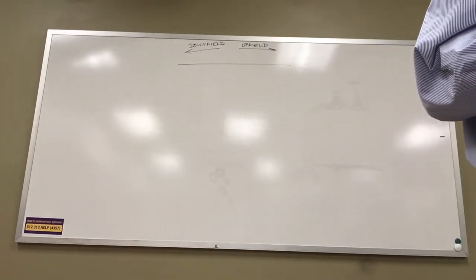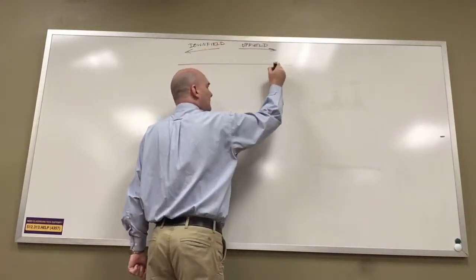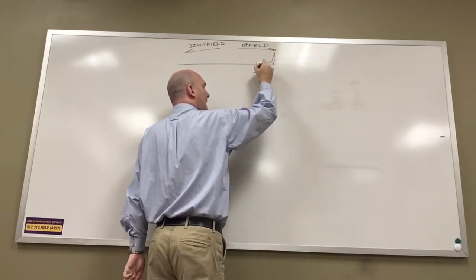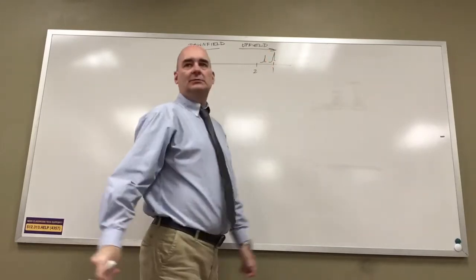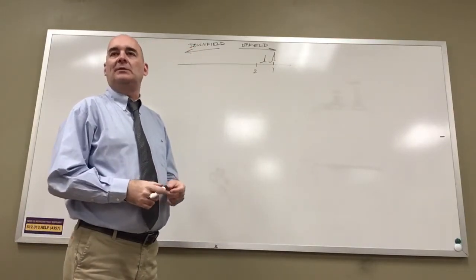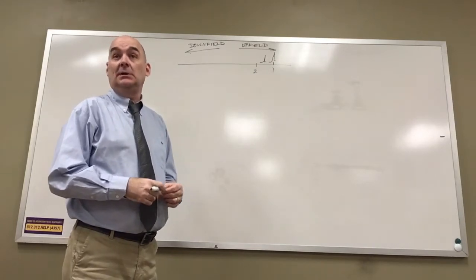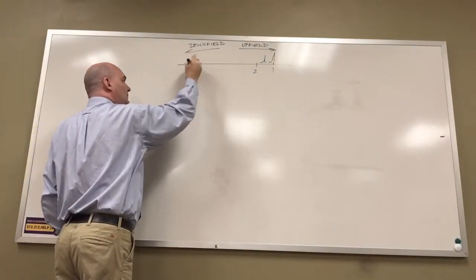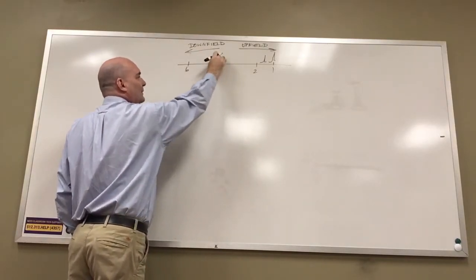If I'm a regular alkyl, I should be there, so regular alkyls are about 1.5. Where are your two signals in this spectrum? Close to 4 and 6. So the one that is next to two chlorines is all the way down at 6, and the one that is next to one chlorine is here at 4.